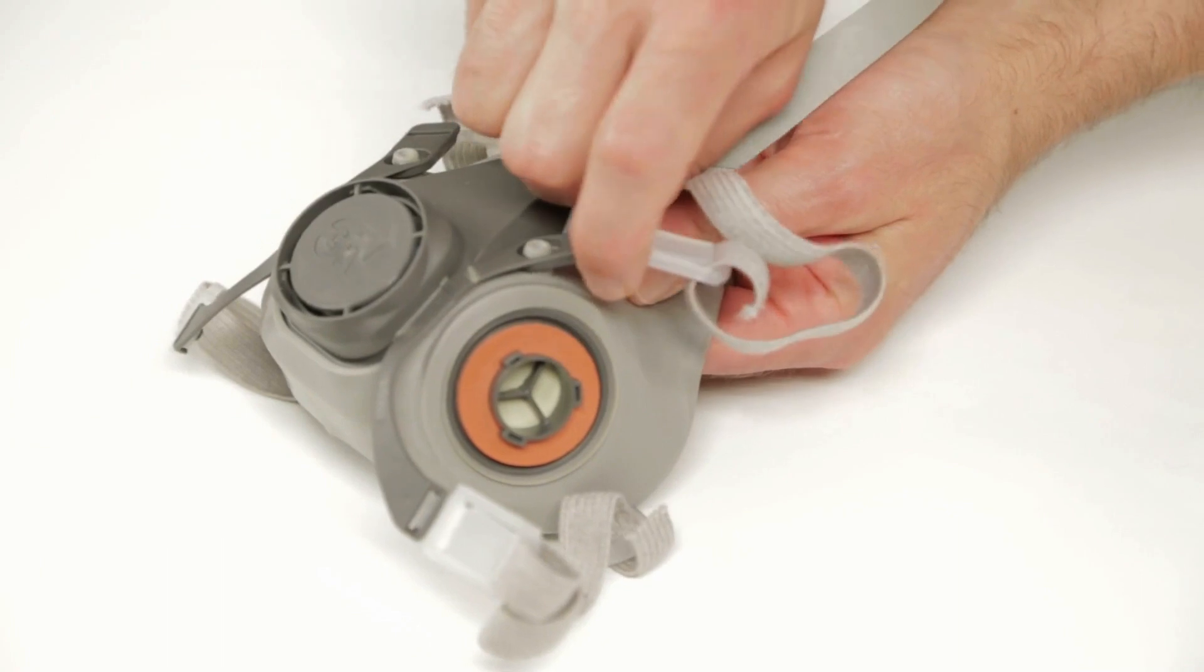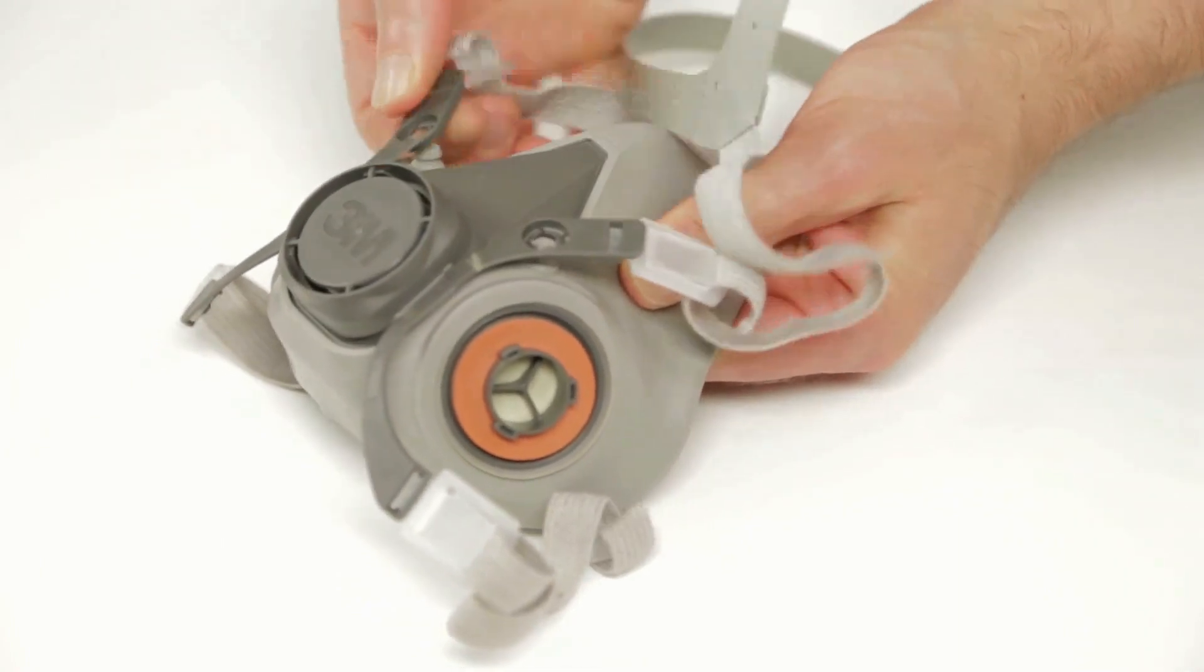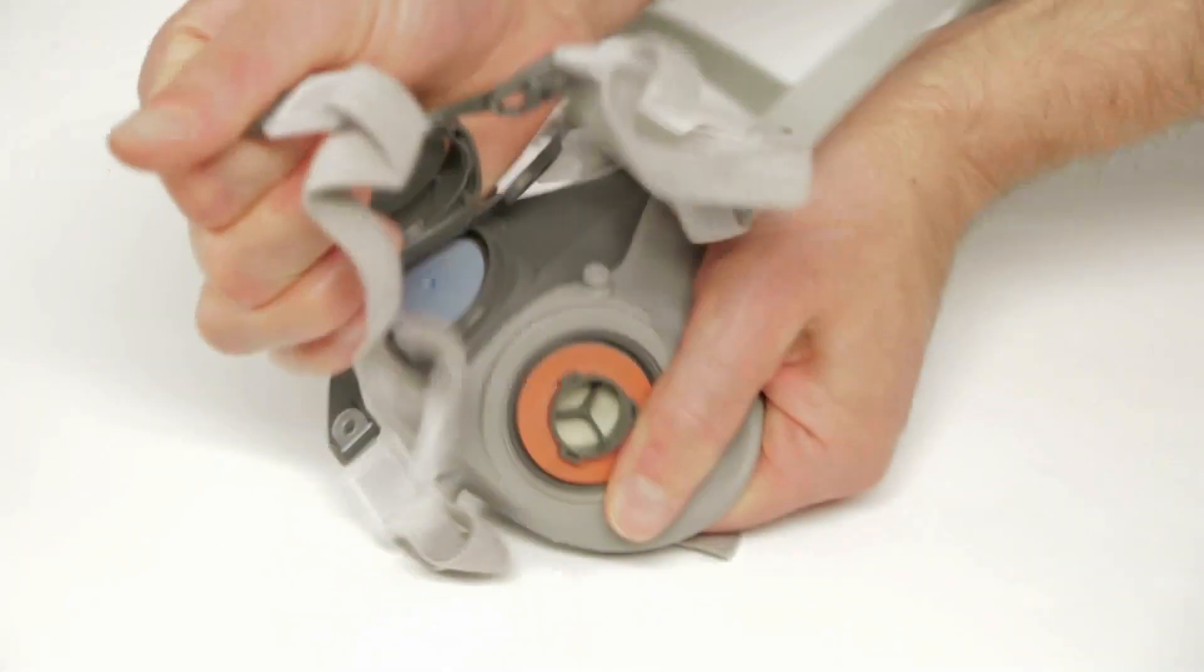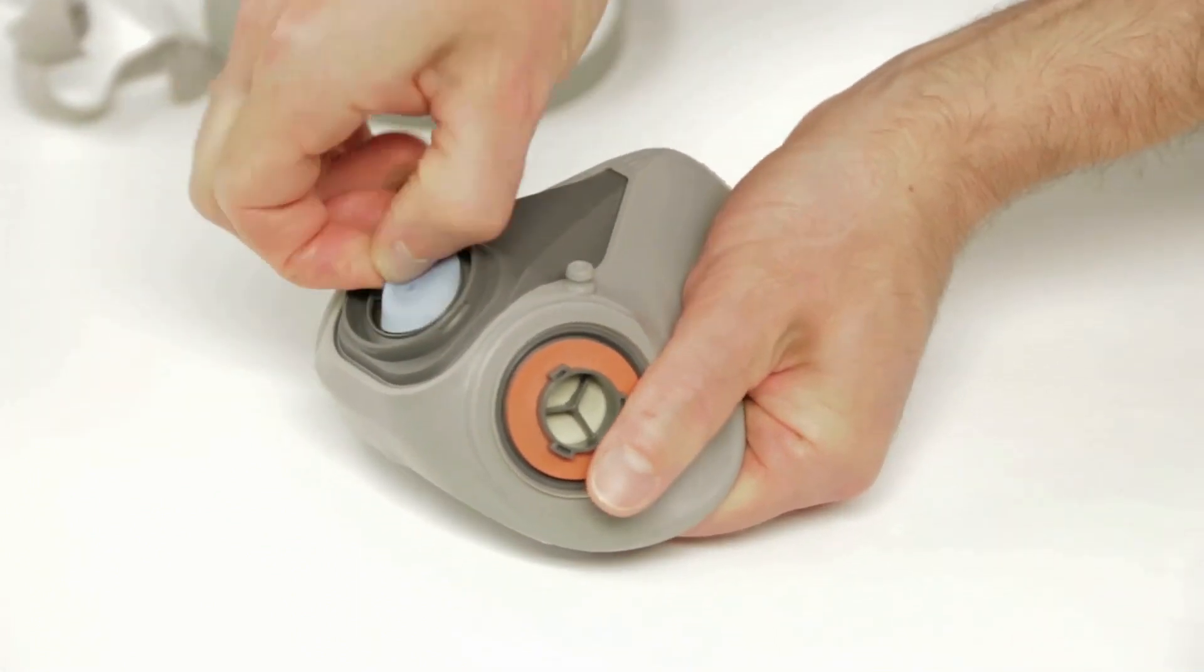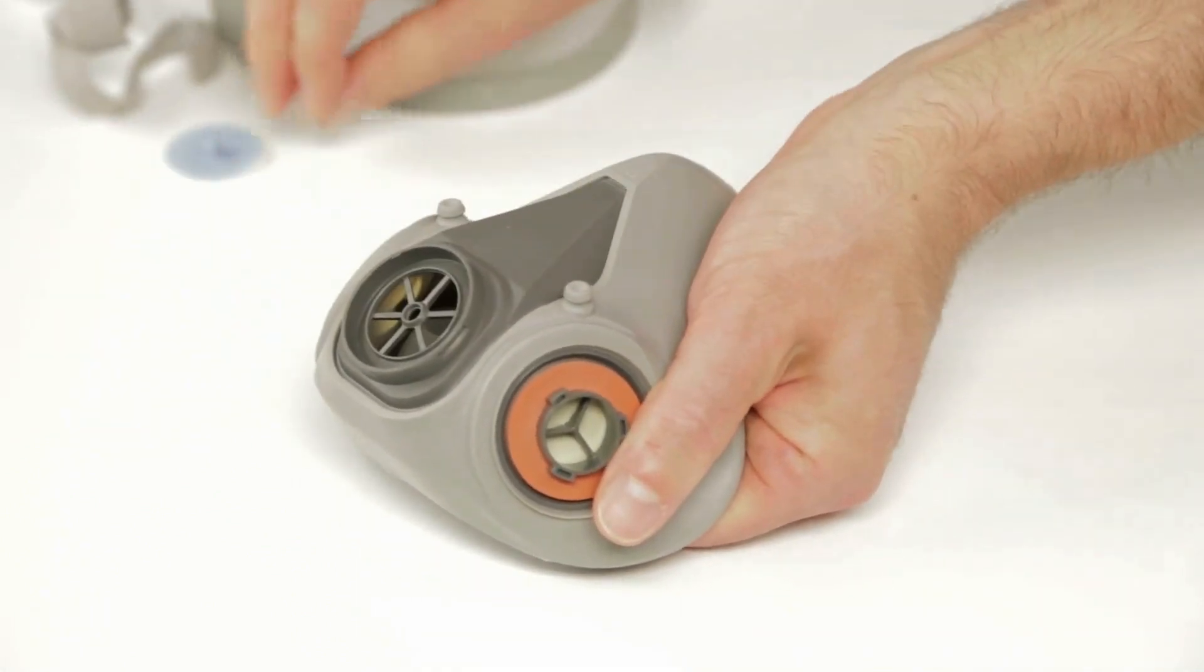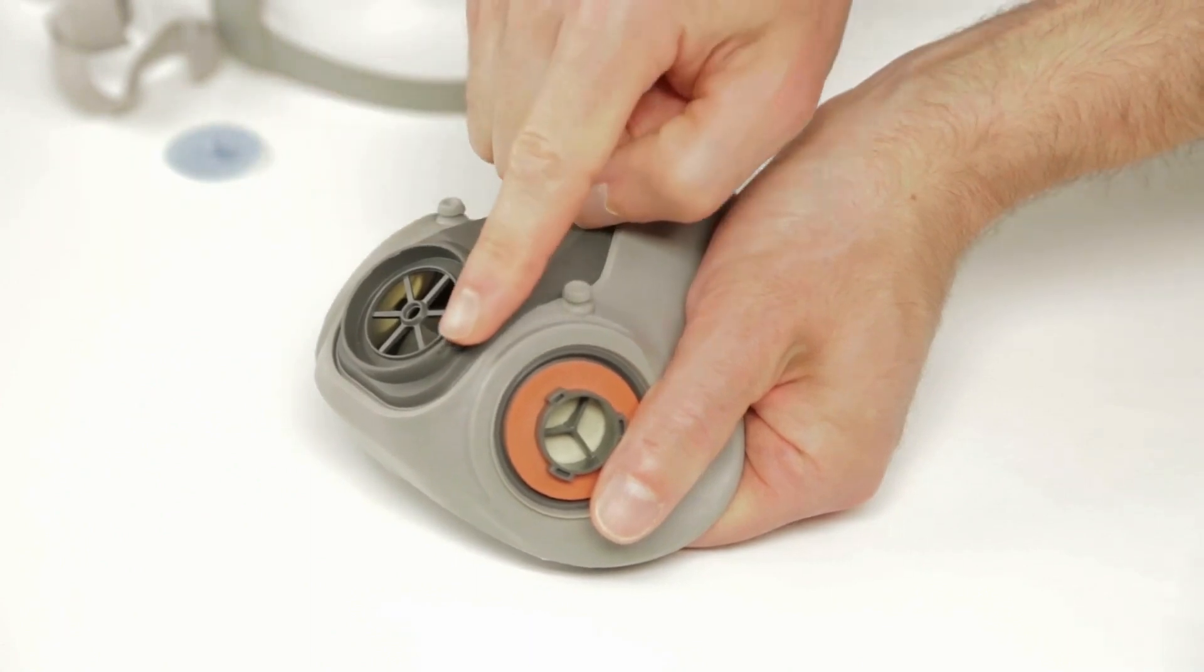To remove an existing exhalation valve, remove the respirator strap assembly as you did before. Grasp the valve and pull it off the center post. Inspect the valve seat to make certain it is clean and in good condition.